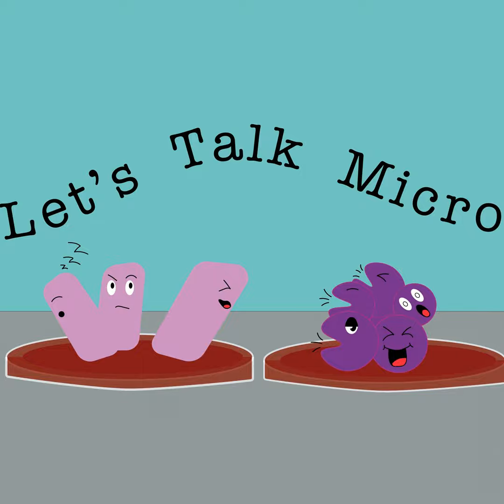I said, maybe have a mayonnaise cap for the petri dish and a pen that can be your inoculating loop, and what else do you need? Oh, you need a Bunsen burner. I would have them set it up and video themselves doing a quadrant streak. Then I would critique them and say, oh, you forgot to reflame in between the streaks. And students really liked it.